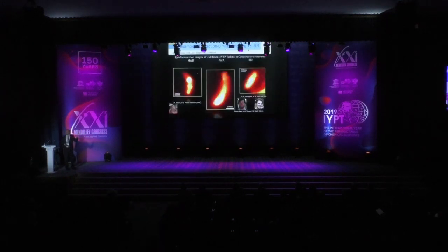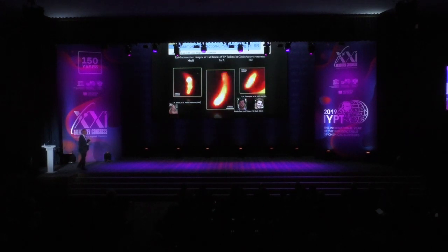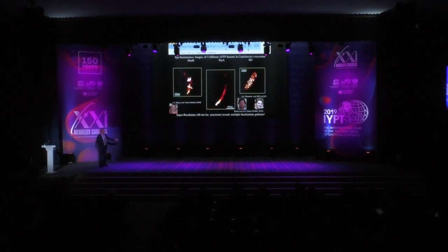Examples now. Let's just enjoy a few cases. These are bacterial cells. Three different proteins inside these bacteria have been labeled by fusing enhanced yellow fluorescent protein, EYFP, to the proteins of interest. Here are the diffraction-limited images. The diffraction-limited images don't tell you very much, but the super-resolution images are spectacular. The difference is just wonderful. With an object as small as a bacterium, it's already close to the diffraction limit in size. So you can see a lot when you just go below the diffraction limit by a factor of 5. And so that's one example.